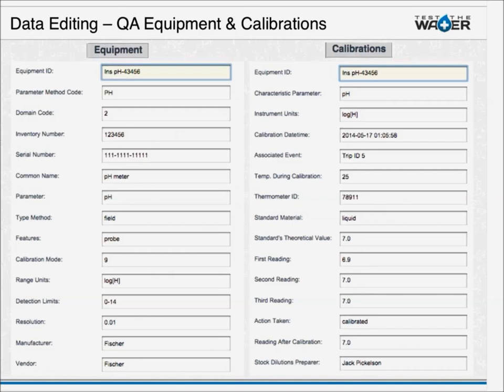One notable feature is equipment tracking. Under the Equipment tab, you can record all your instrumentation, give each piece a unique ID, and reference all appropriate fields and details. Each piece of equipment can be tied to any number of calibration records. Groups that have calibration days can enter calibration event information, go do field collection, tie the equipment to that data, and then view before-and-after calibration events to see where data lies in relation to those — providing quality control around equipment as well as the data itself.